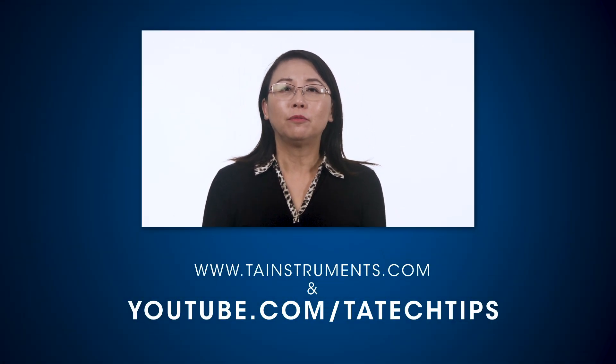In this TA Tech Tip, we have demonstrated how to set up the relative humidity accessory on a DHR rheometer. Please stay tuned for more TA Tech Tips and thank you for your interest.